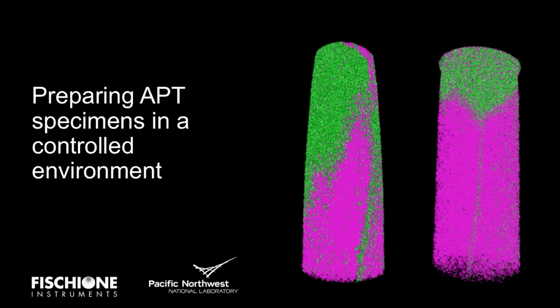That's right. And with the exposure to the ambient with a lot of that damage, you get enhanced oxidation during an ambient transfer, and all that gallium and oxygen we actually found leads to lower yield. So it lowers our ability to collect these larger data sets. It becomes more challenging. So being able to remove that damaged area leads to larger data sets where we can make these conclusions.